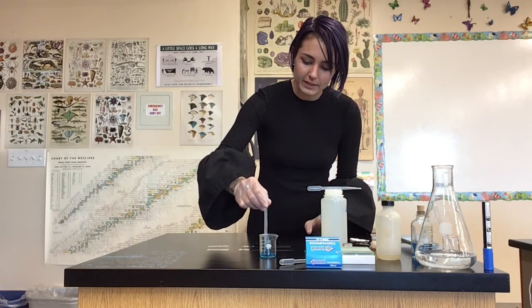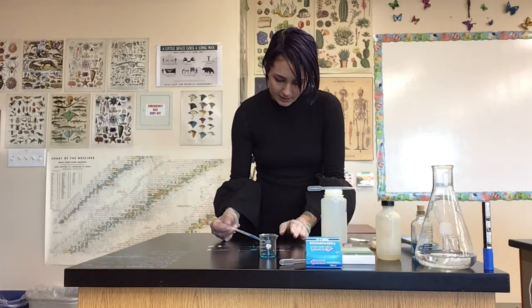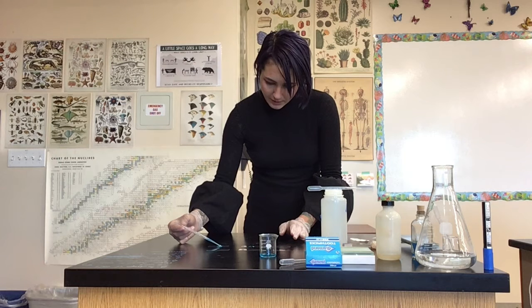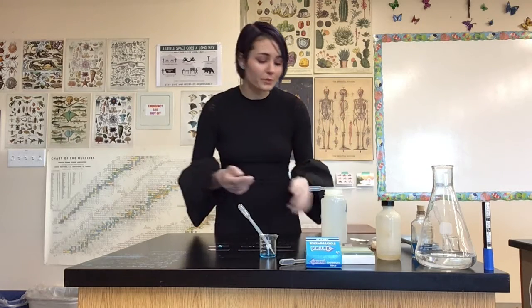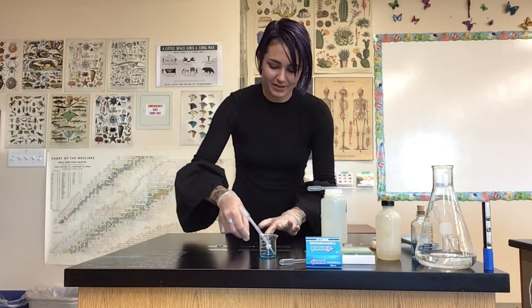Now that I've got those nice and rinsed off, we're going to administer some drops of the methylene blue. I've got that right here once again, and I'm just going to do a few drops so that we can get them stained and then hopefully see some cells undergoing mitosis. The chance that we'll see cells undergoing mitosis is higher in the garlic root cells than in my cheeks, just because they're on the tips of those roots, which means that they're probably undergoing much more active cell replication than the cells in my cheeks. But I thought it would be worth a try since I've got all of my equipment out anyways.